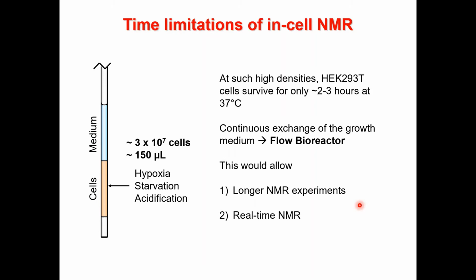This has 2 benefits. One, it allows us to record longer NMR experiments. So multidimensional NMR experiments could virtually be recorded if we had more time to do so. But also, and I think more importantly, we can monitor events in real time. So things that change over time can be monitored in a time-resolved manner.